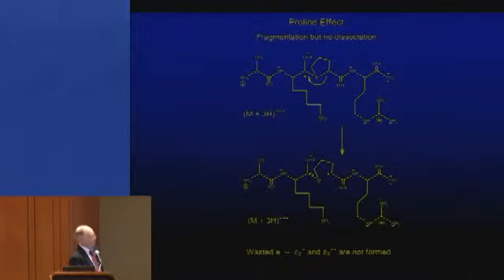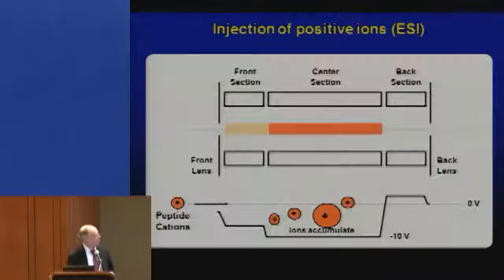And the other thing bad about this process of chemically fragmenting proteins in the gas phase, about the only thing that's bad, is that proline is not a helpful amino acid. So if you transfer the electron into the amide bond that connects to proline, the same chemistry takes place, but now you open up the ring system and the two fragments stay together. So capturing electrons into proline amide bonds uses up the electron, doesn't help you fragment the protein, and is therefore a negative effect. But that will be important also a little bit later.